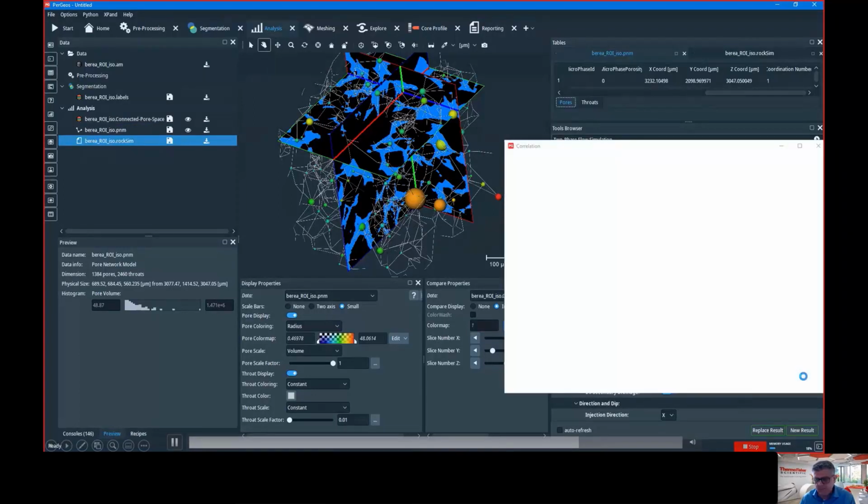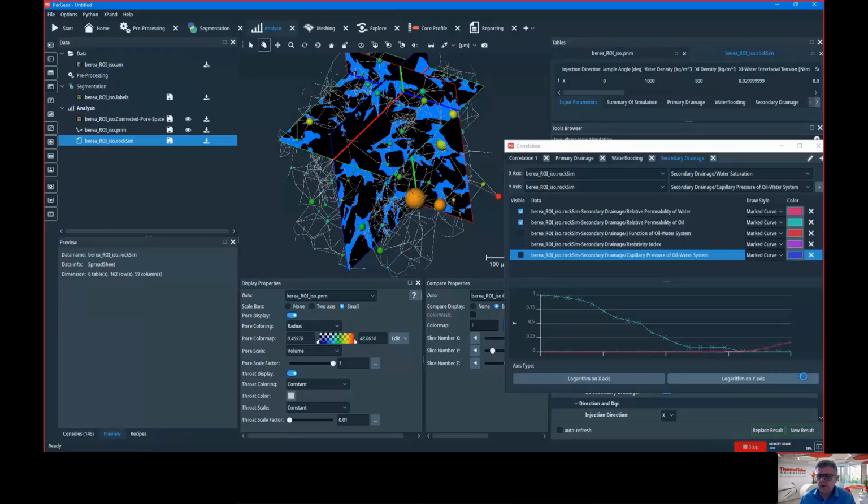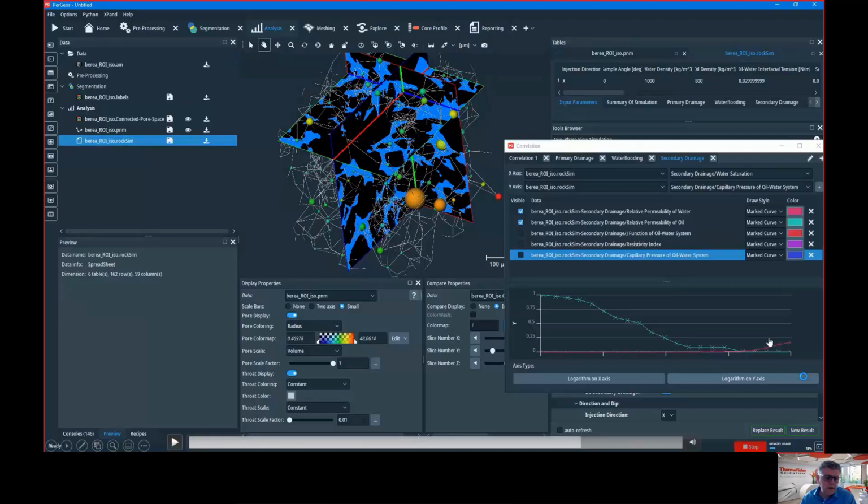It's quite fast, because that's the concept of pore network, right? If you want, you can do lattice Boltzmann two-phase flow. It's going to be very slow, and it's going to be on each voxel. So the pore network model takes a while to build, and then I can simulate through the pore network faster. And so you can change the input parameters of the simulation and obtain multiple simulations. Anyway, the pore network model will produce tables like that, and it will render the charts automatically, so all the curves.